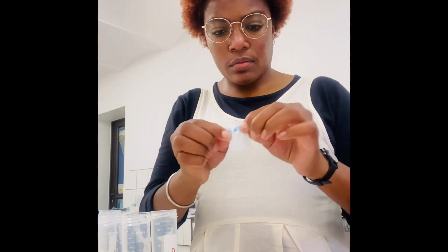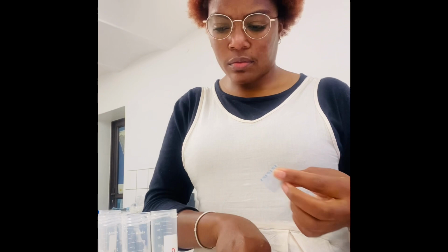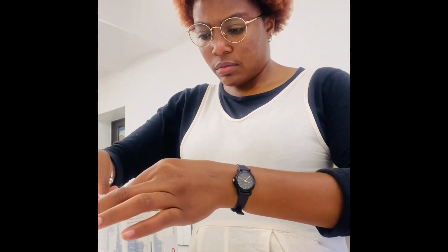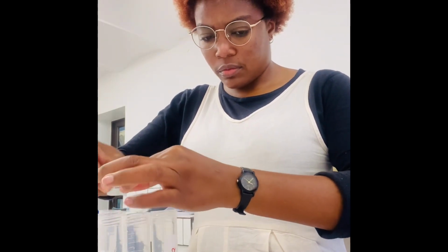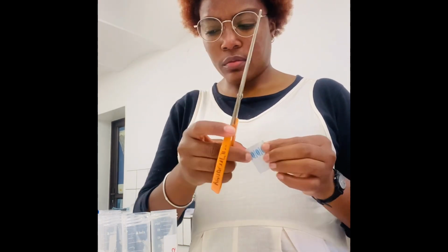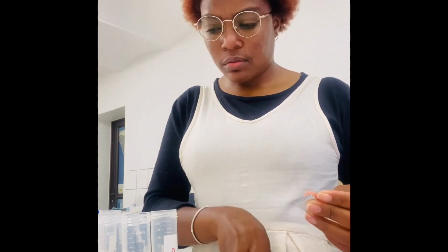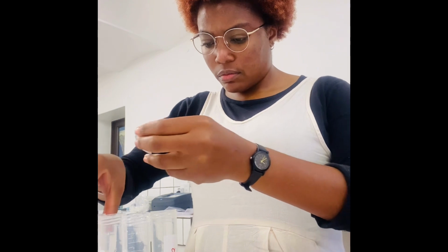And with nowadays technology, it's quite simpler. When you have to do it manually, like before we got this machine, other people used to use different methods where the level of contamination is so high, and it's time consuming.